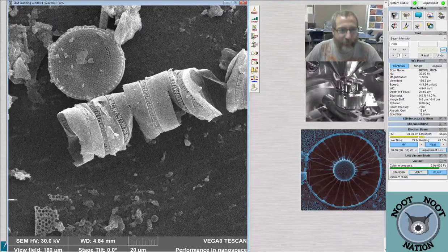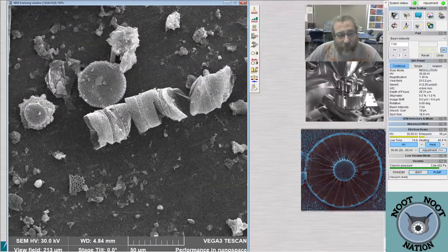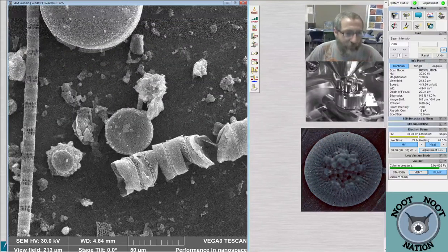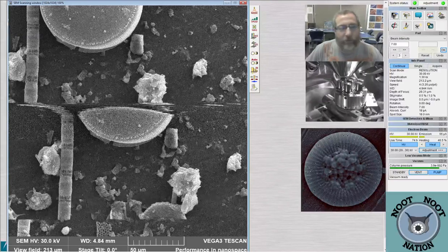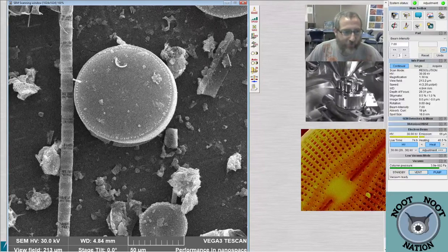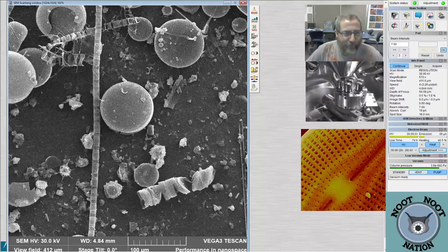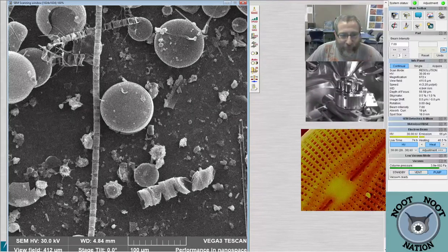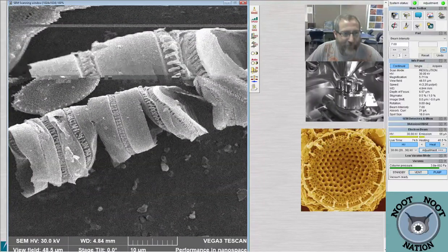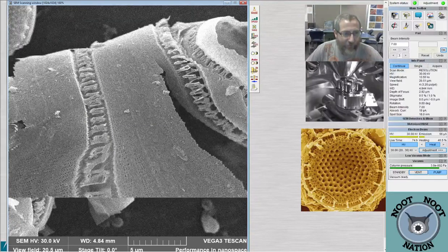We are looking at some materials that Pacific Plankton sent me, I guess they arrived on Thursday. And then another set of samples that are in here as well that are from, I guess, the week before. I was just trying to figure out what this thing was, and I have no idea. So I'm just going to pretend it doesn't exist and move on. Or you could take a picture of it, and then we can look it up later. I suppose. It is kind of weird looking. It's super weird looking to me. The spines are very strange.